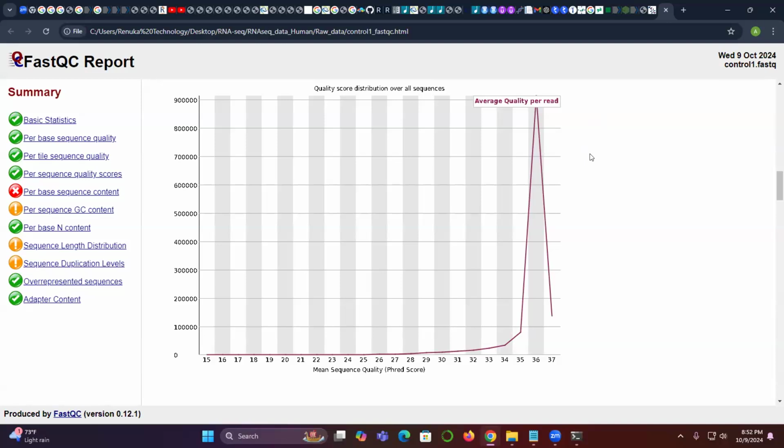Clear? What is this per sequence quality score? Any doubt here? You can respond, guys. No, ma'am. Okay, clear, fine. Go down.